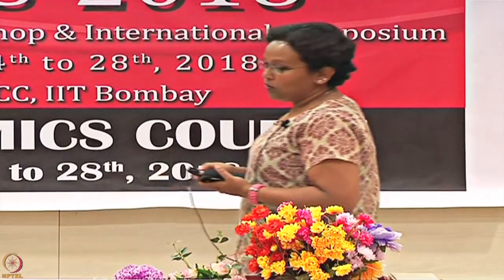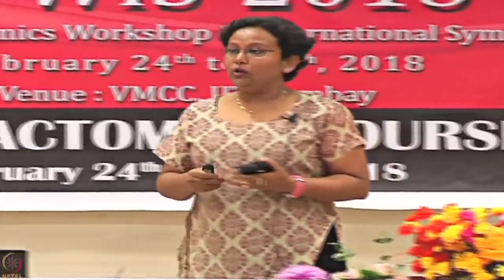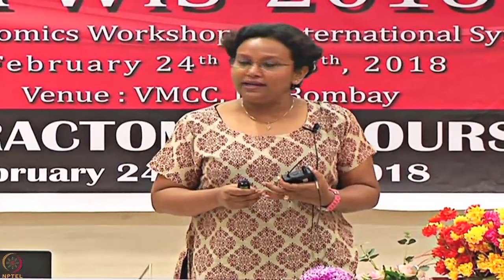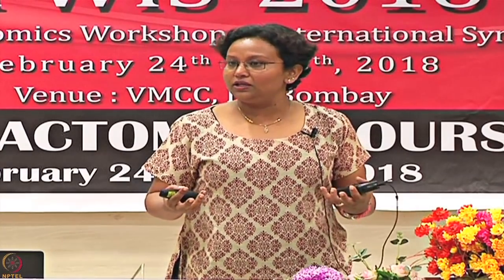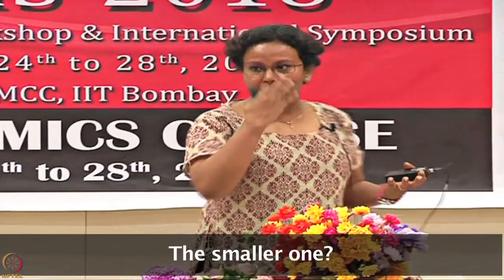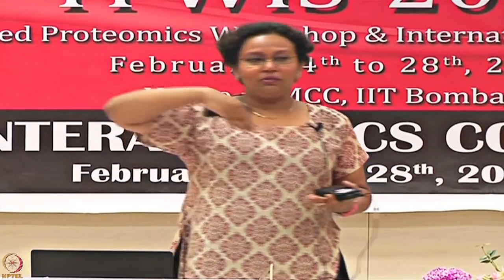The first thing that you would like to look at is the molecular weight of the interactant. Which one would you think should go as a ligand? If you have two interactants and one of them is large and one of them is small, which one would you like to go as a ligand? The small one, absolutely, because you can use the larger one as an analyte, so you get a higher response.